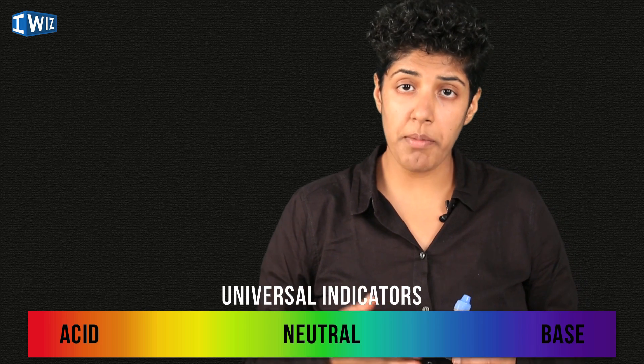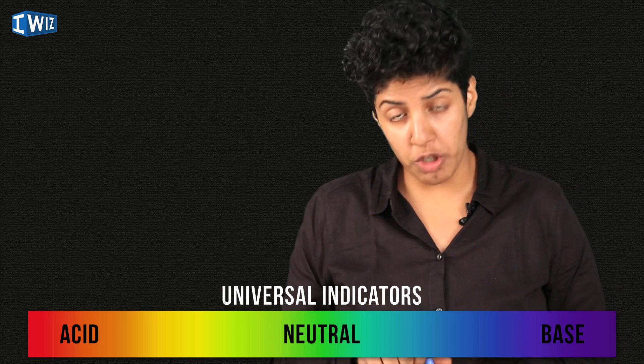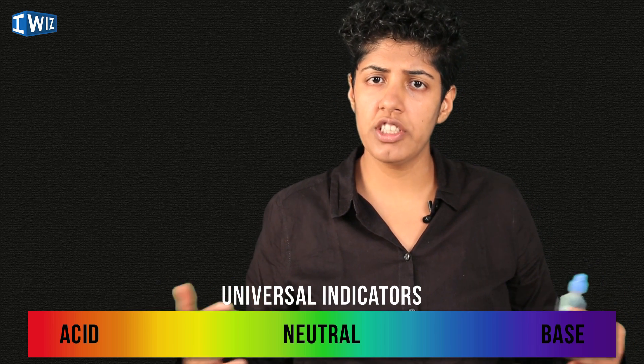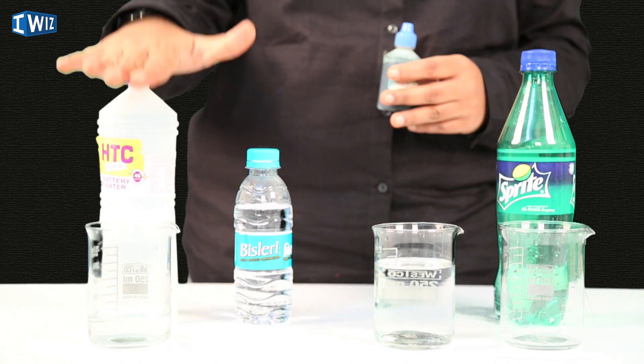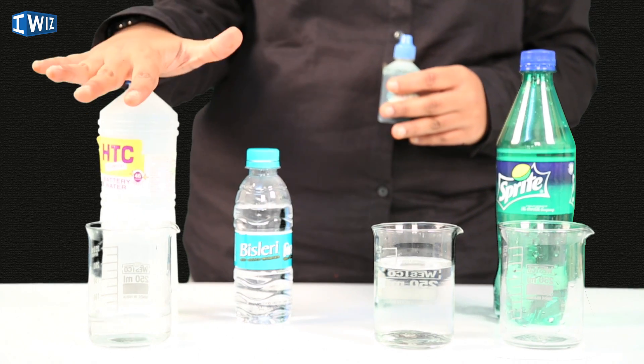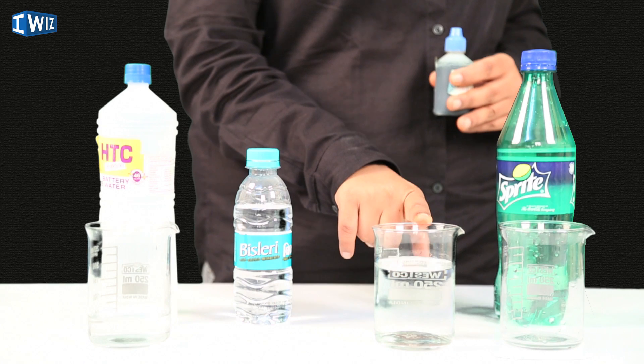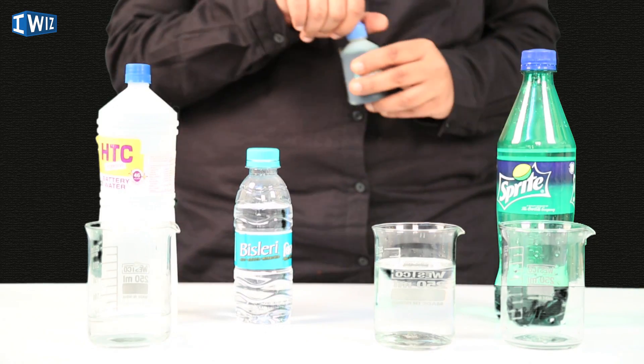Let's talk about the importance of pH. The universal indicator helps determine the pH of a particular solution. We're going to test a wide range of things, starting with water. I have four different sorts of water: distilled or deionized and demineralized water, mineral water, water from a swimming pool — which you may know has chlorine added — and carbonated water.